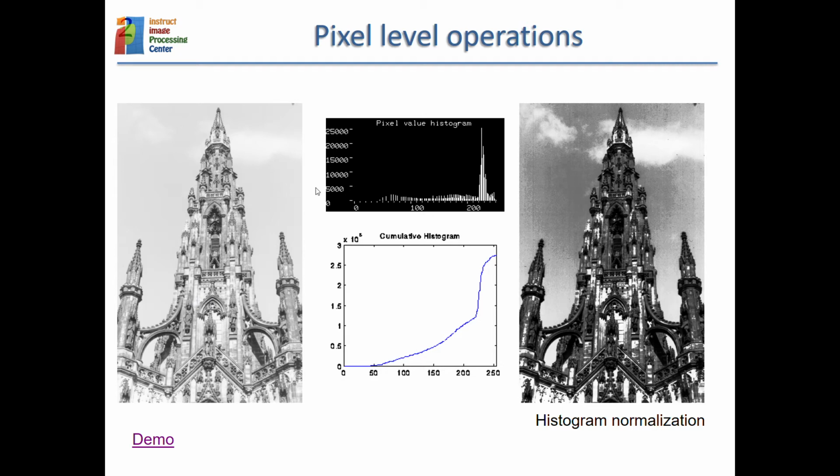You transform the value. Originally, let's go to the original. So originally it is like this. Here we have the original histogram, and our transformation is almost identity. So if I take an input value of 200s here, it will be substituted by 200s.